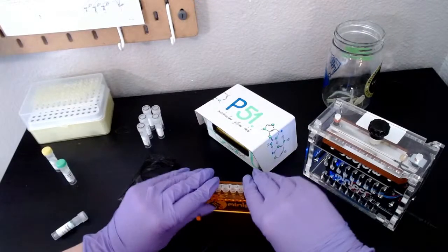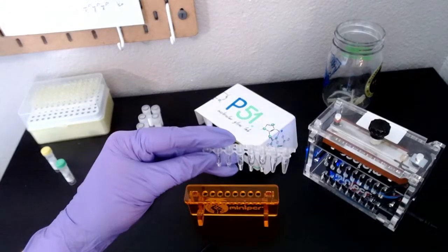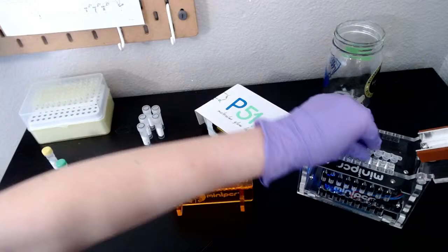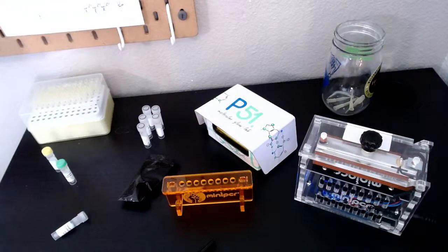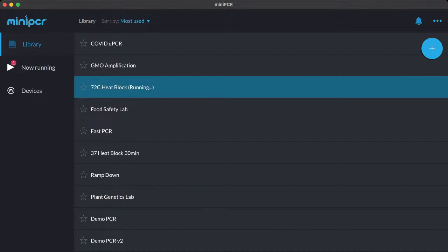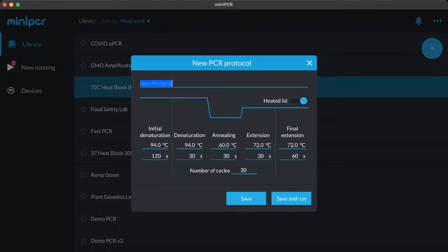Now all our tubes are set up. I'm going to add caps to these tubes, and now we have all six samples ready. I'm going to add them to our PCR thermocycler — our mini 16 — where we're going to run our reaction. This is connected to my computer via Bluetooth. Now I'm going to bring you back to my computer and hop into our actual mini PCR app.